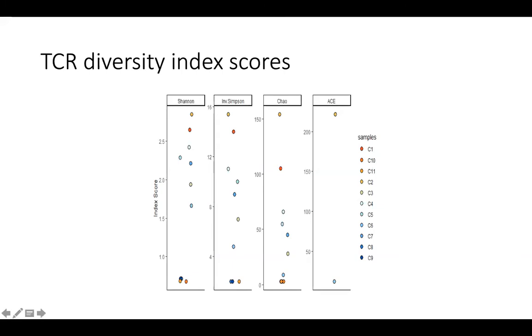So TCR diversity usually corresponds to, obviously, underlying biology, and in the context of drug response or vaccines, you ideally want just a fewer sets of TCR sequences that are clonally amplified, because those are the ones that are actually responding to whatever stimulus is being given. So the lower the diversity, the better it is, essentially, because if you have too many different TCR sequences, then it doesn't mean that there are any particular types that are actually responding to a stimulus.